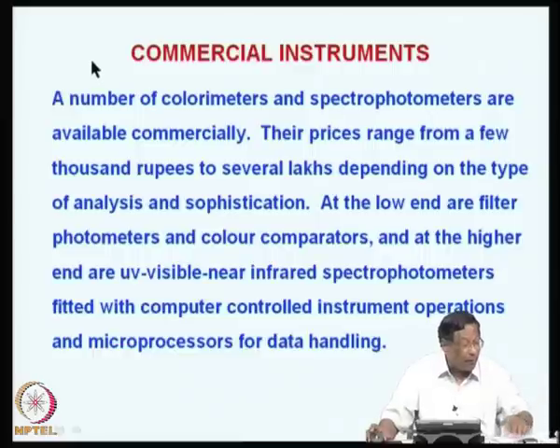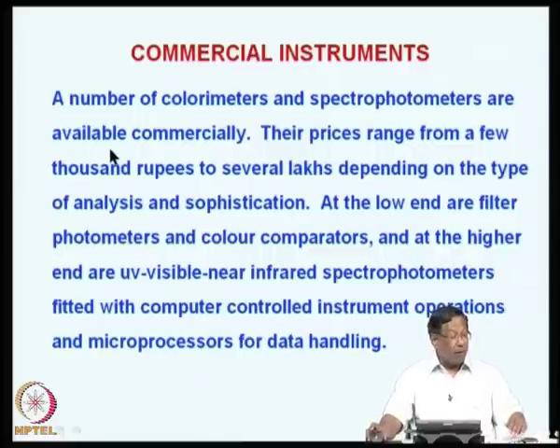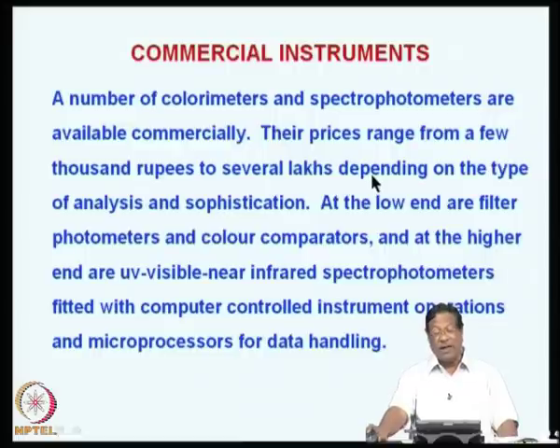Now, let us look at some of the commercial instruments. There are a number of commercial instruments available in the market. You can see colorimeters and spectrophotometers. Their prices range from a few thousand rupees to several lakhs, depending upon the type of analysis and sophistication. You can even make one within a few hundred rupees in India for a dedicated analysis, that is a colorimeter.